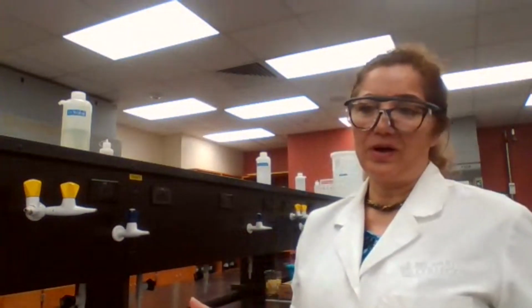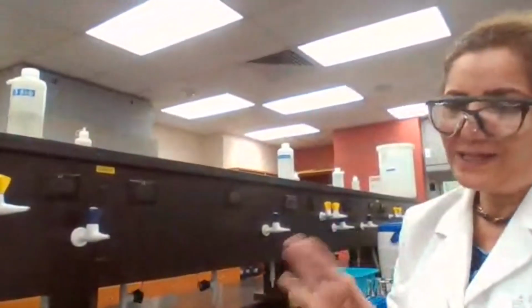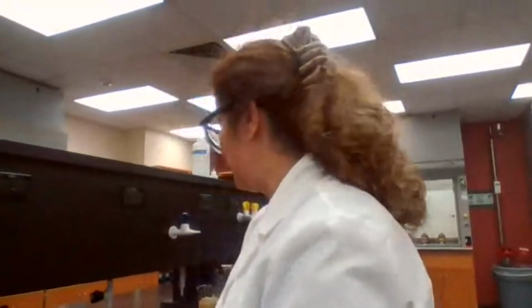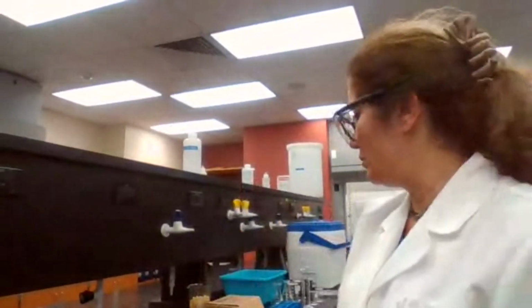The timing is not going to be enough to lower the temperature, and you will get byproduct. And if it turns dark brown, you have to start all over again. But if it's a light yellow color, we can wash that with the recrystallization. It can go away, or we can continue. But if it's a dark brown color, to repeat it, you have to start all over again.